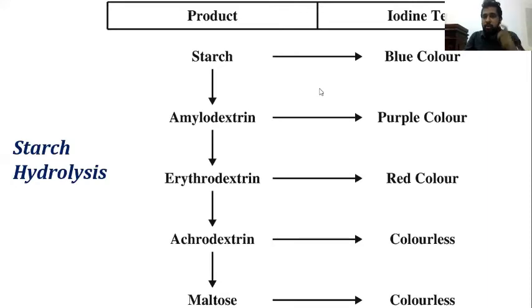I don't know whether you can remember, check if I am telling you lies. In your science syllabus at ordinary level, we have to do the starch hydrolysis using enzymes in saliva. There we just put our saliva to starch, and then we add sodium chloride and citrate. What is the reason for adding sodium chloride and citrate? We have learned these things.